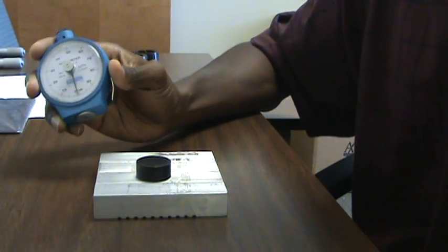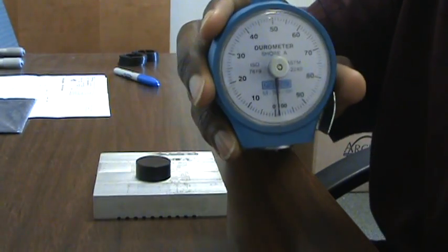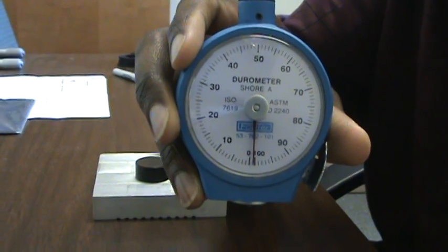Hello. I want to briefly show you how to test durometer with a Shore A durometer. This durometer gauge reads from 0 to 100 on the Shore A scale.